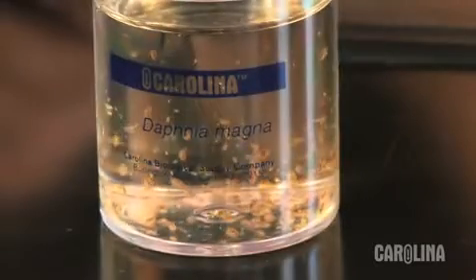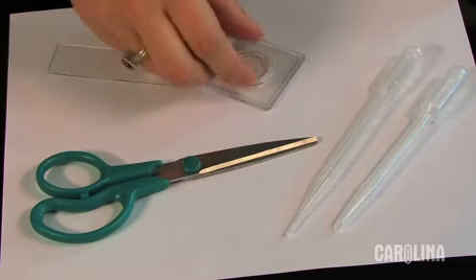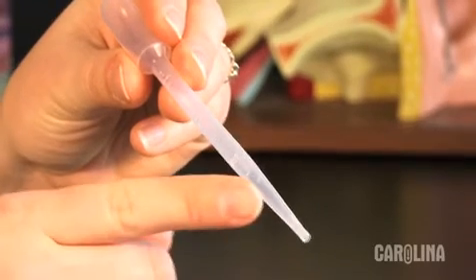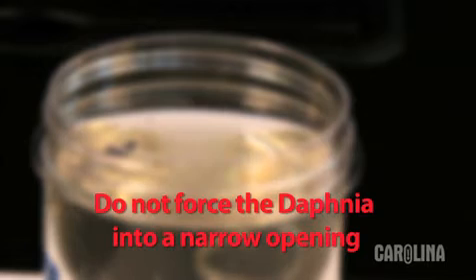To view Daphnia, use a microscope and a glass or plastic slide and pipette. Do not use a cover slip, as this will crush the Daphnia. Daphnia can be larger than the opening of the pipette, so remove the end of the pipette at a 45-degree angle. Do not force the Daphnia into a narrow opening.